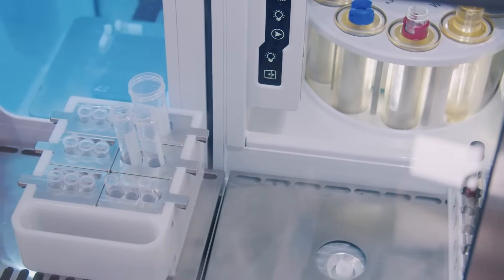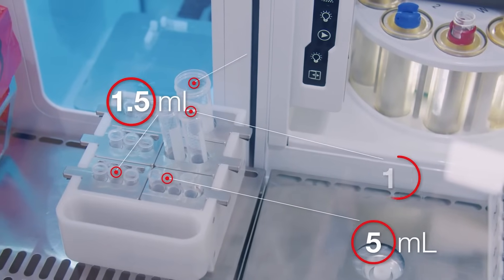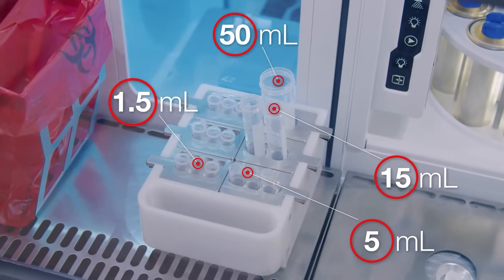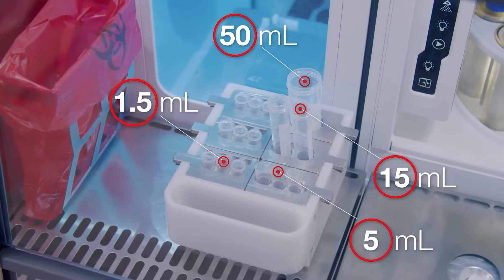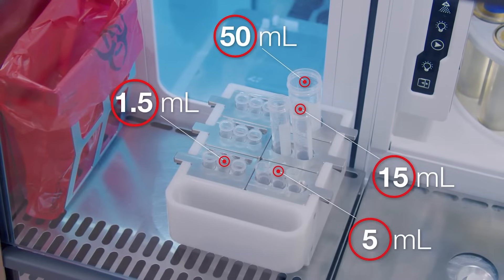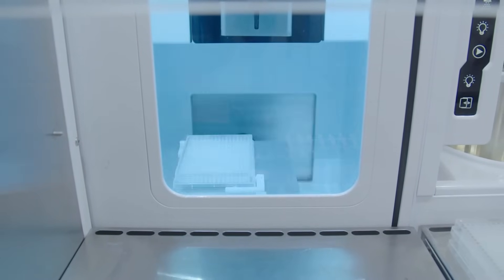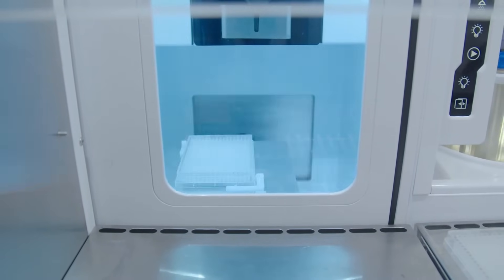The system is also capable of multi-way sorting into 1.5 milliliter, 5 milliliter, 15 milliliter, and 50 milliliter tubes with an easily configurable sort output tube holder. The speed and recovery of the Bigfoot Spectral Cell Sorter is designed to exceed your expectations.